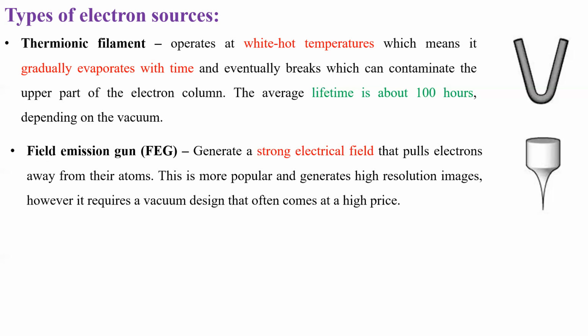The basic difference between scanning electron microscopy and field emission scanning electron microscopy is majorly high resolution and also higher magnifications. If you want to analyze your sample at lower magnifications, one can go for a tungsten filament equipped scanning electron microscope.